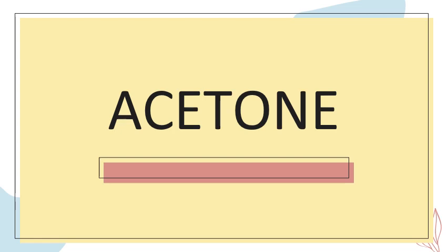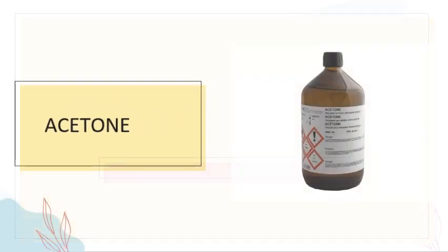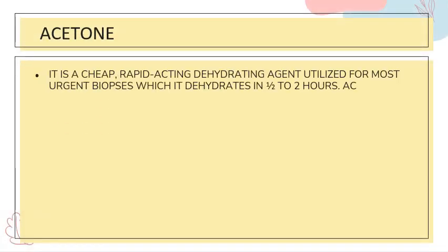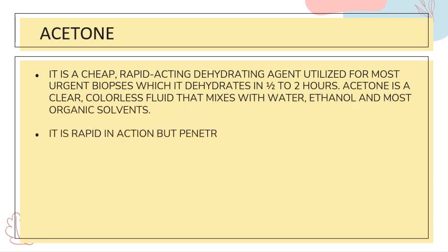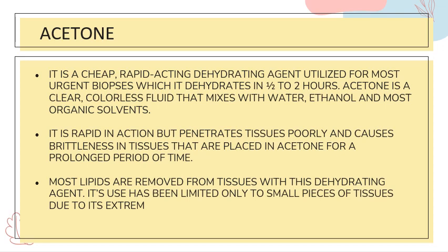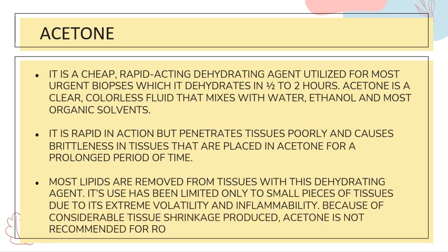Now we move on to the second dehydrating agent, which is acetone. So this is an example of an acetone. Acetone is a cheap, rapid-acting dehydrating agent utilized for most urgent biopsies, which it dehydrates in 1/2 to 2 hours. Acetone is a clear, colorless fluid that mixes with water, ethanol, and most organic solvents.